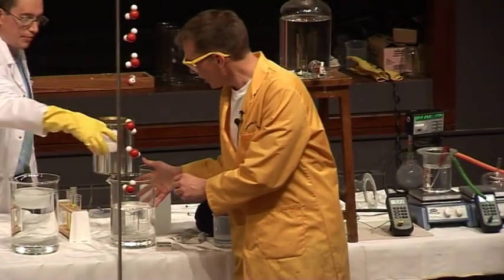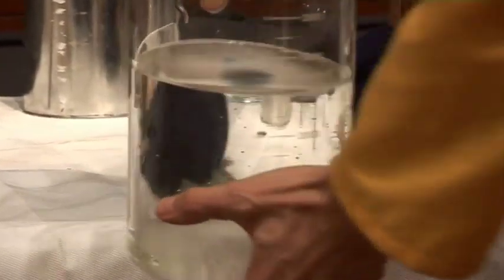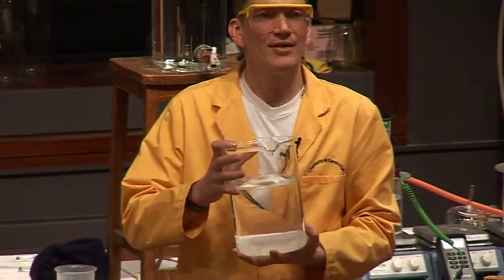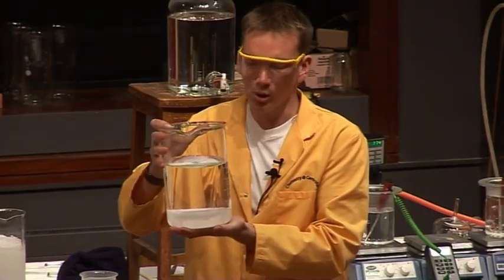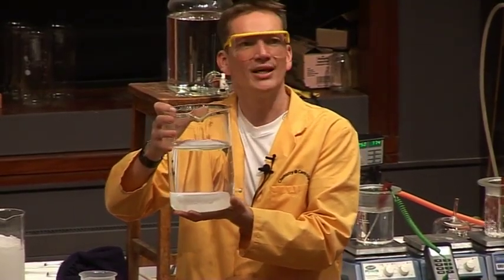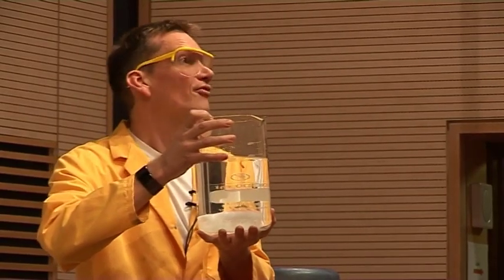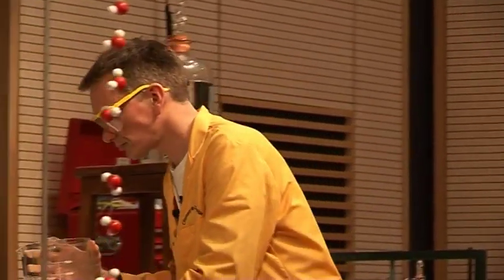Here we have some solid cyclohexanol. We've just added this to the liquid cyclohexanol, and this one actually sinks. In fact, this is the usual case. It's more normal for a solid substance to sink when we put it in its liquid. It's actually very unusual that water floats when it's ice on top of liquid water.